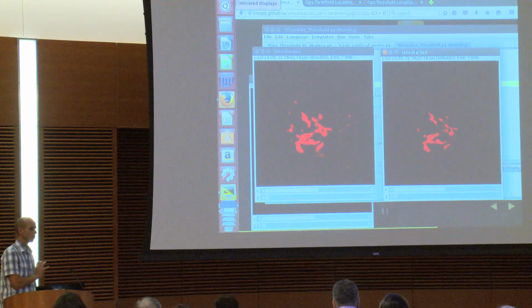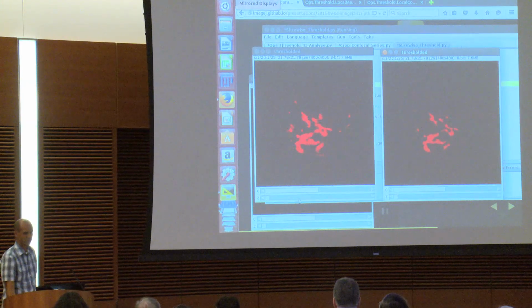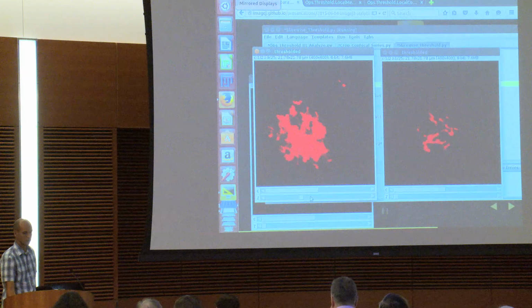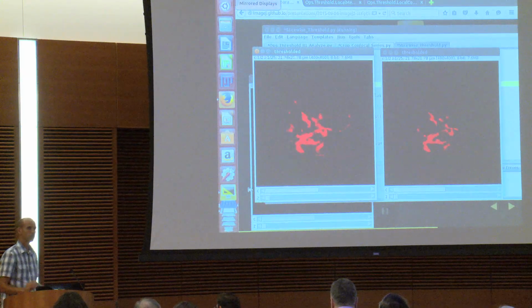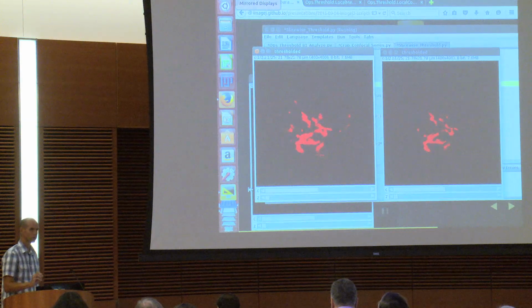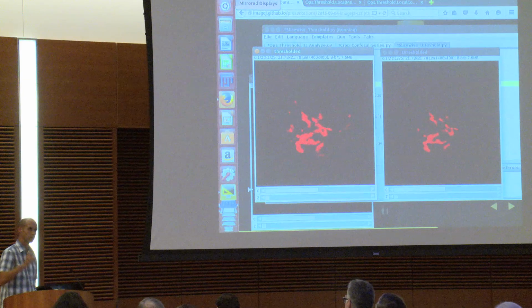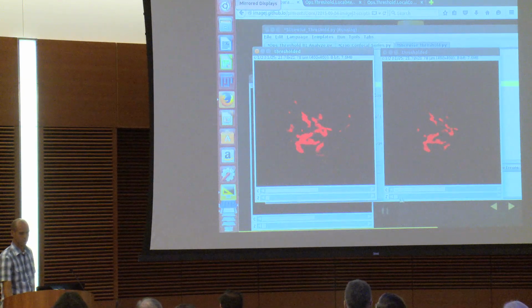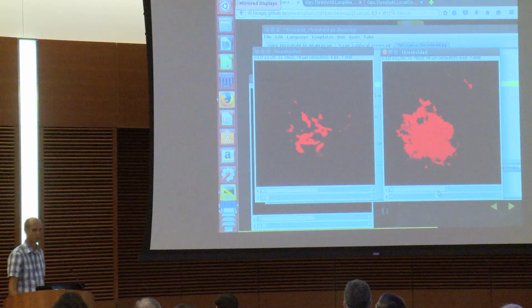So the threshold was actually calculated on the entire volume, so you got a different threshold. In the first case, each slice has its own threshold, so it's going to threshold more pixels from each slice, because it's not considering the entire range of values in the volume. This time, it used the entire volume, so you get a different result.